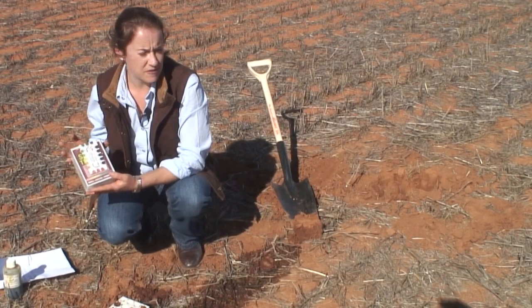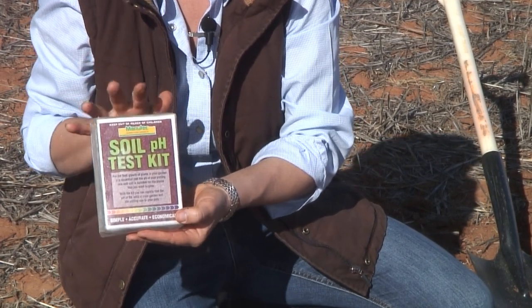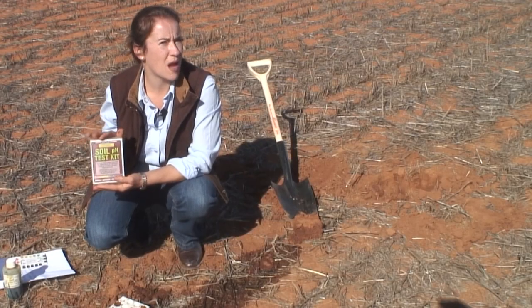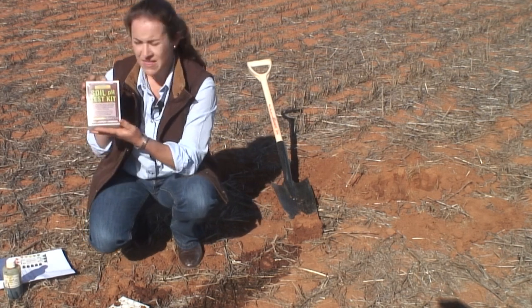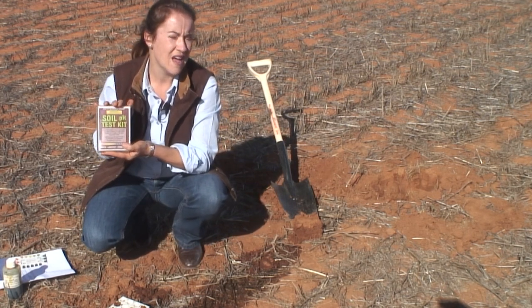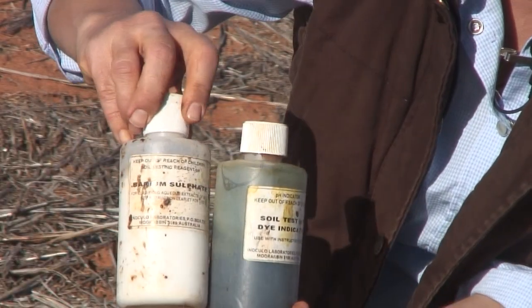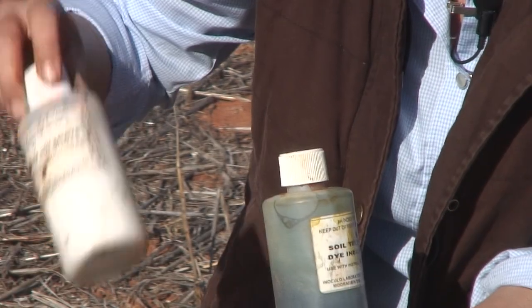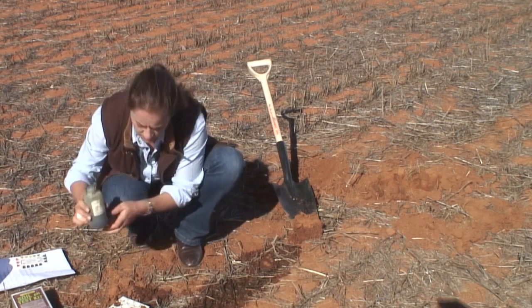Testing for soil pH is very simple and something you can do yourself. You can pick up a soil testing kit from your local plant nursery or rural supplier in town. These little kits don't cost very much and are an easy way to test in the field. I've got some larger bottles here, but it's the same material you'll find in a smaller pack — this is the material that reacts with the soil to give the result.